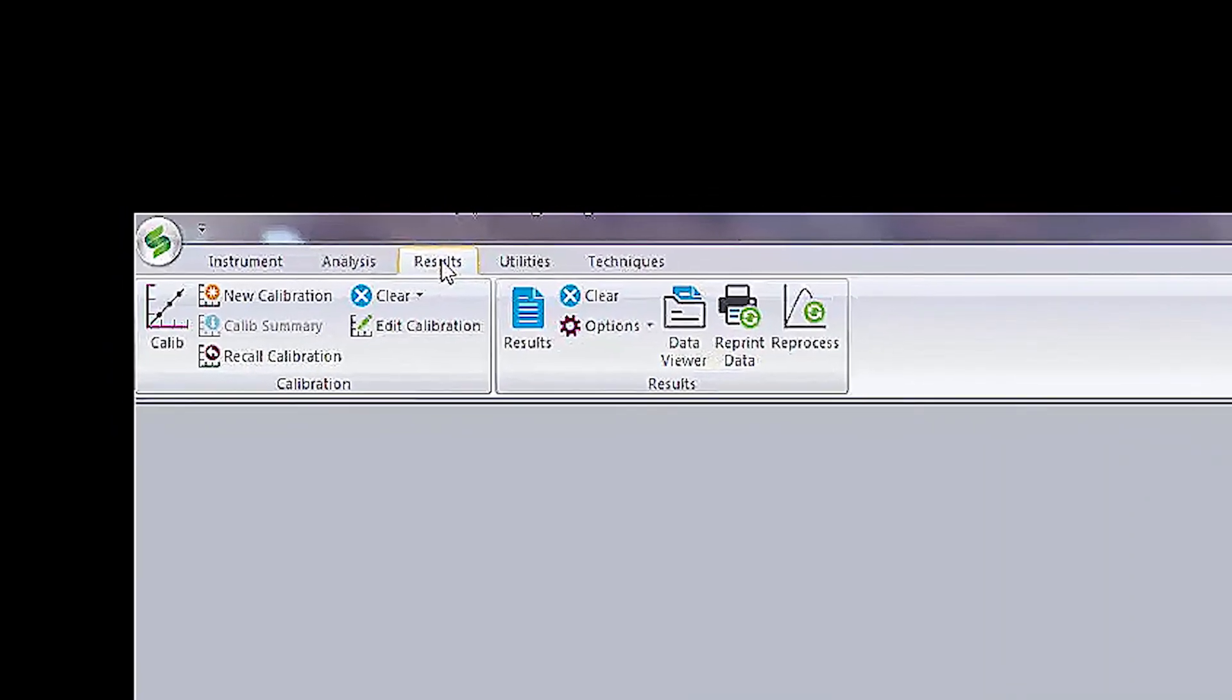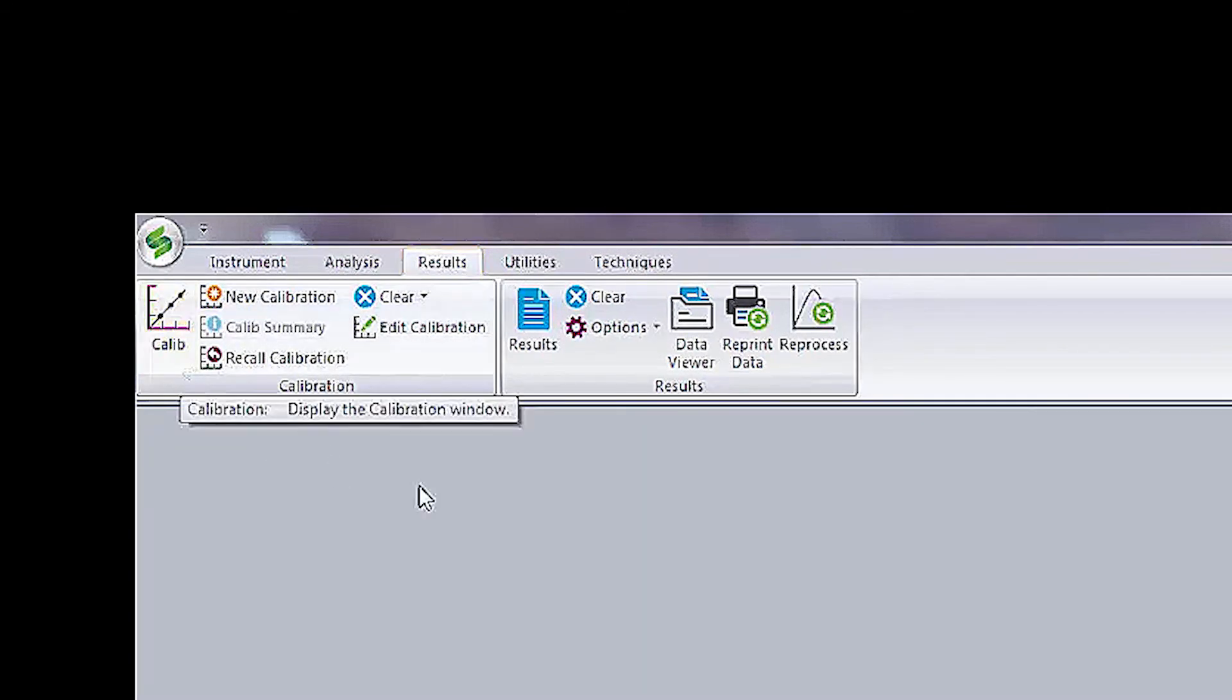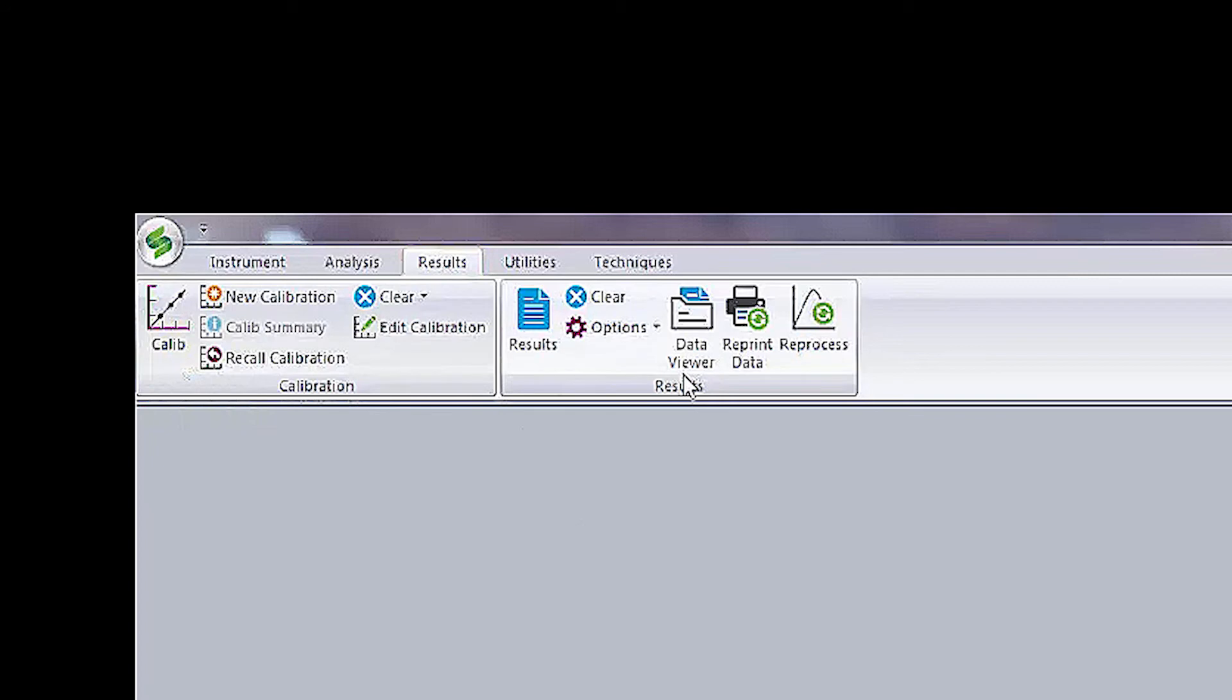The next is the Results tab. Here you can review and edit your calibration, review data, and reprocess results.